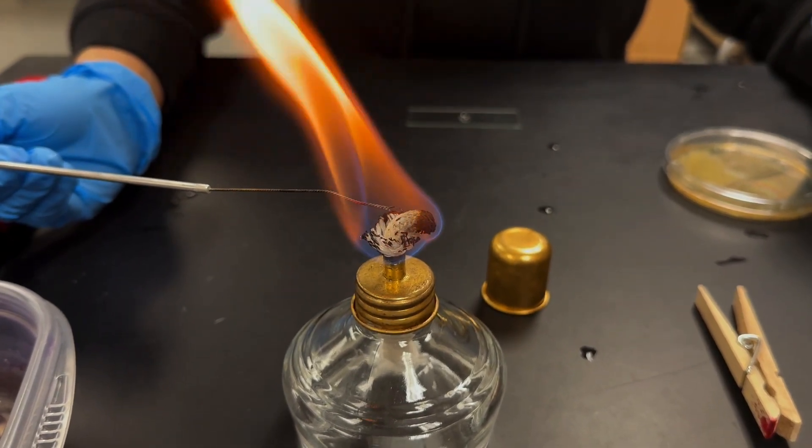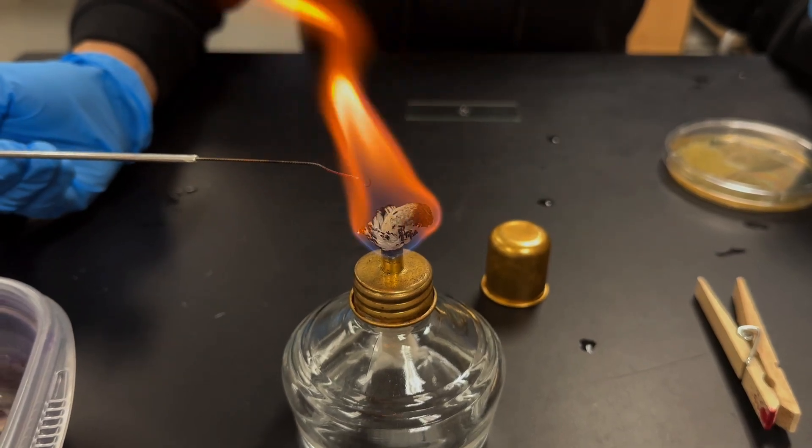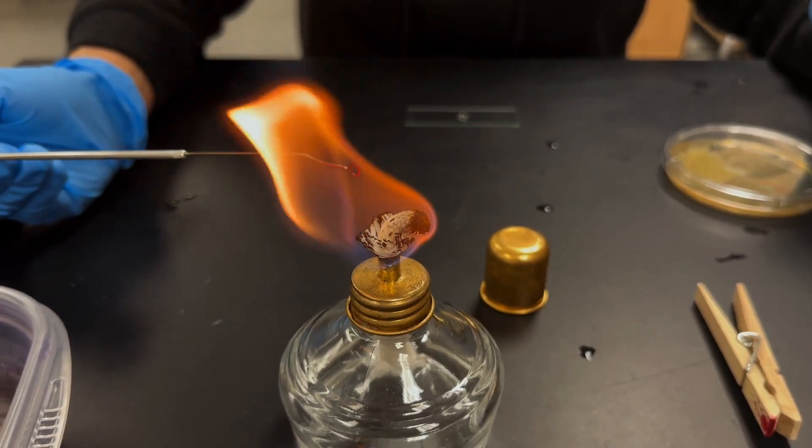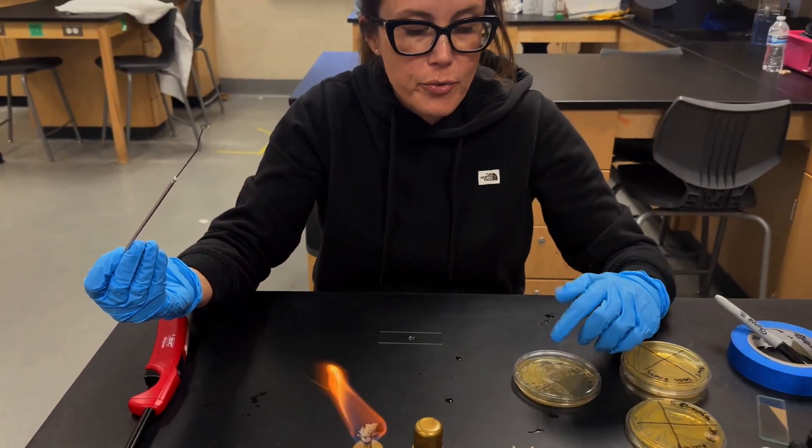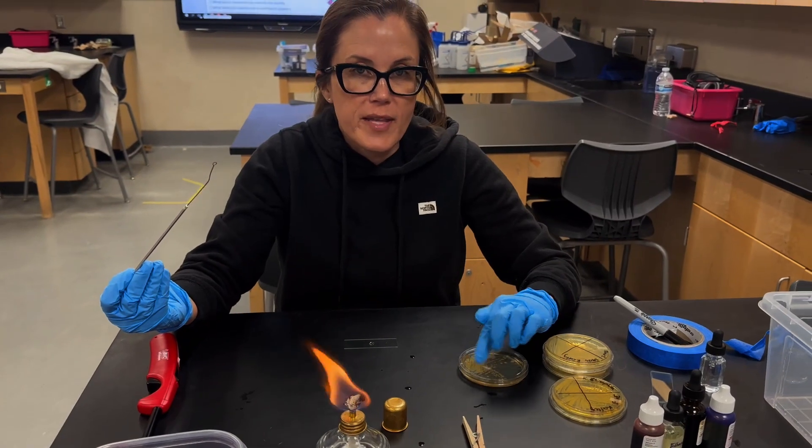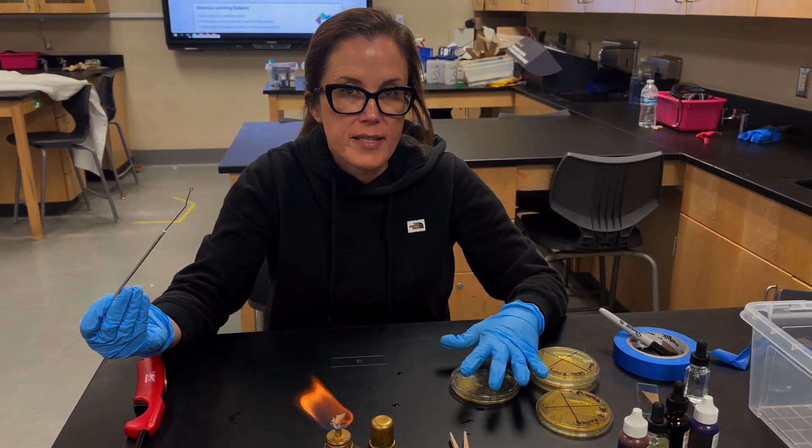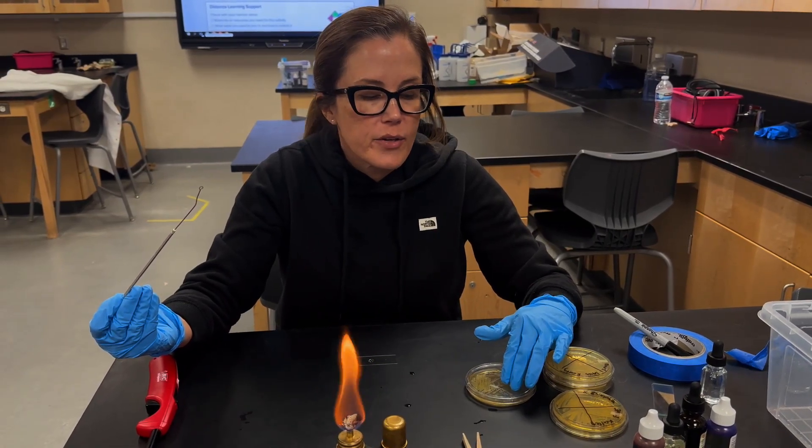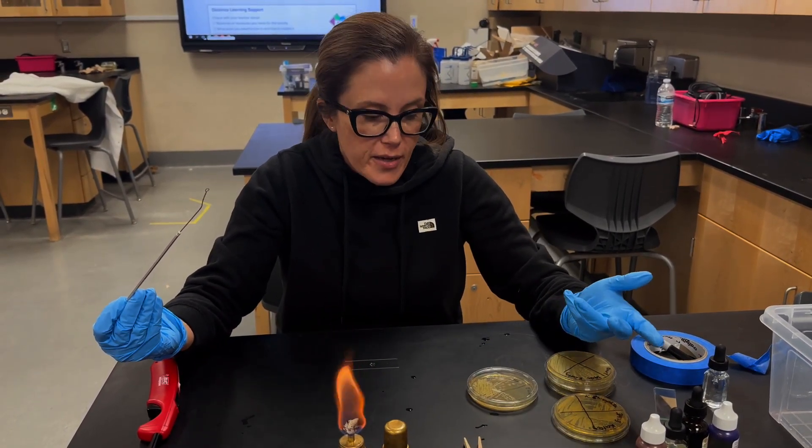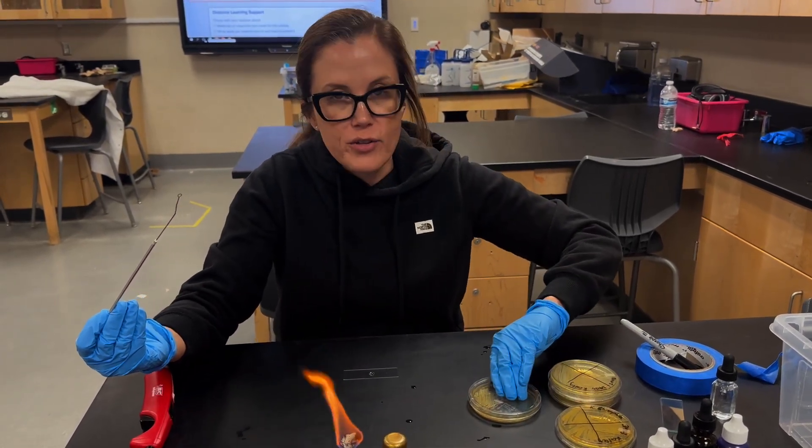So you'll sterilize your loop until it turns orange. You'll let it out of the flame, let it cool. And then what we'll be doing is removing one of the yellow colonies from the patient samples, one that you've isolated. If you and your group members weren't able to isolate a colony, you can see another group to get a colony from them. Or your teacher may have one as well that they'll be willing to share with you.